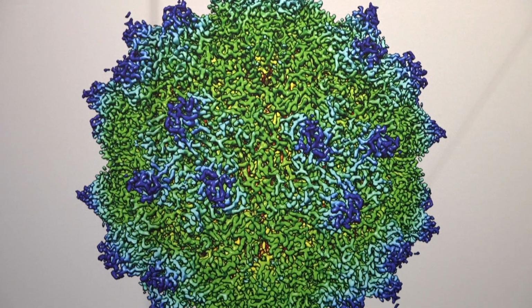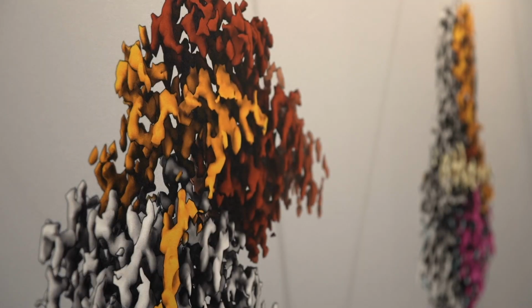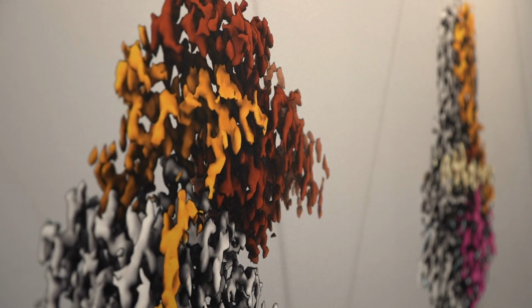And so that Krios is basically the workhorse of Cryo-EM and can do tomography, it can do micro-ED, it can do single particle analysis, and really just these beautiful structures that you see here are done either on the Glacios, the Krios, or the Tundra. All three tools just are enabling structural biology for our customers and our users and for drug discovery.